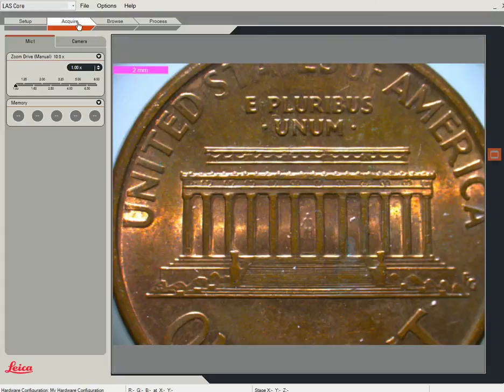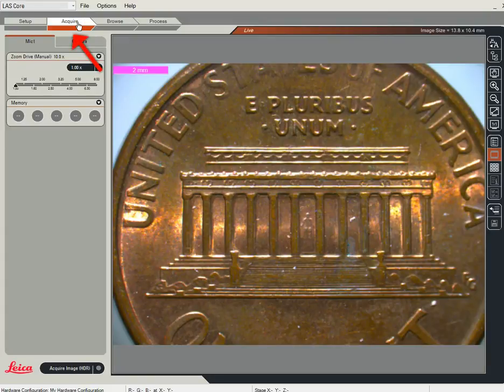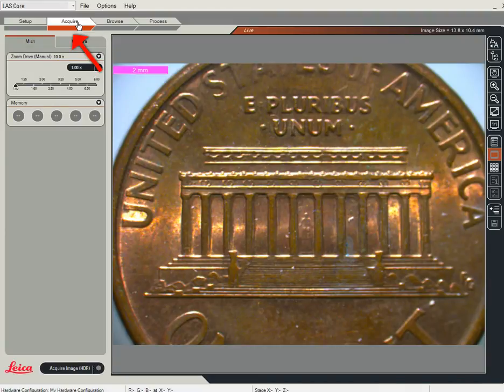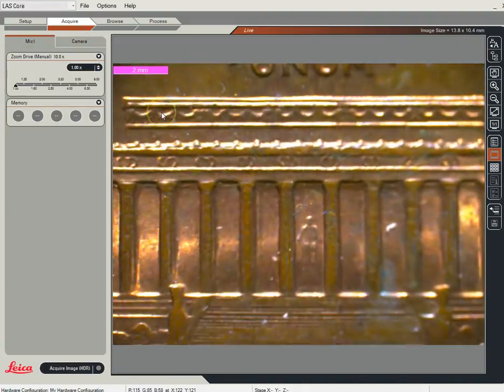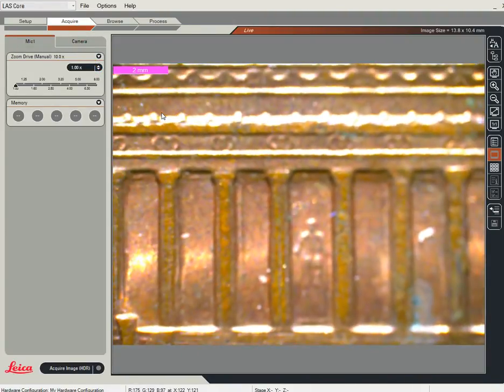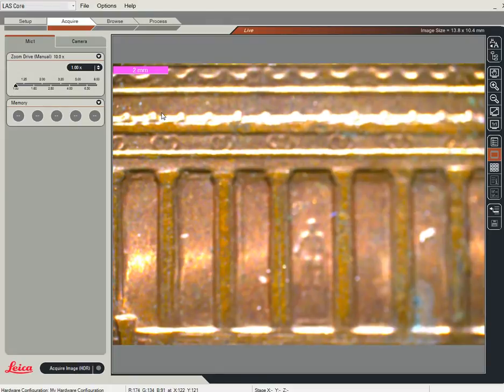Go to the Acquire menu and you can see that what we're going to do now is we can actually take a picture. There's a zoom — I'm using the manual zoom on the scope and I've gone to about two and a half times.